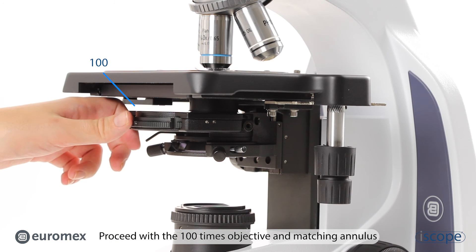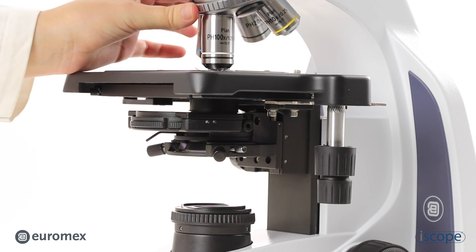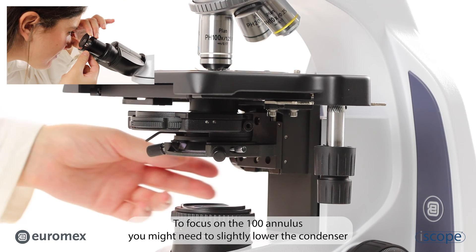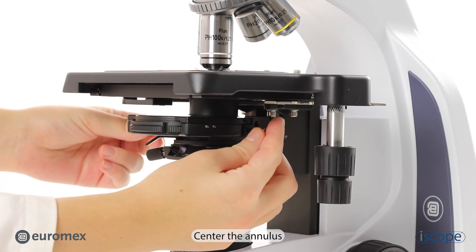Proceed with the 100 times objective and matching annulus. To focus on the 100 annulus you might need to slightly lower the condenser. Center the annulus.